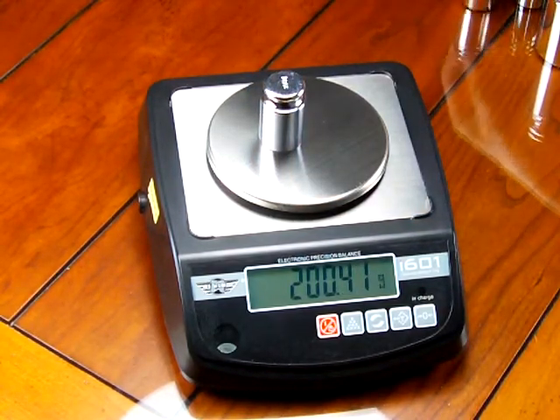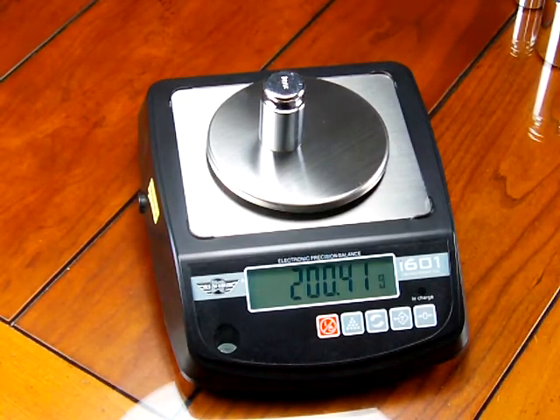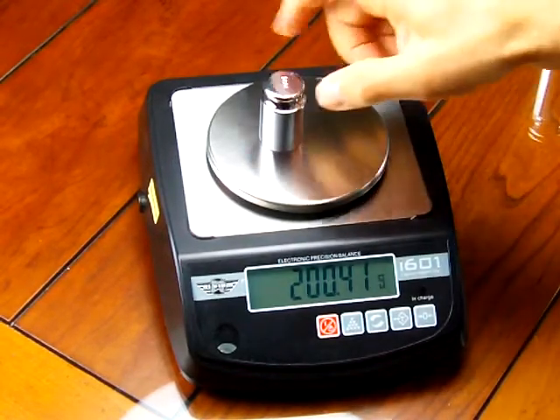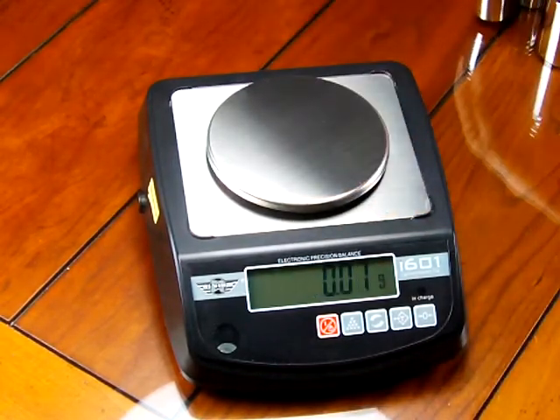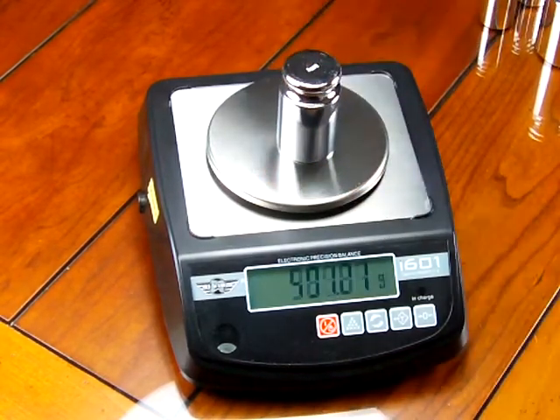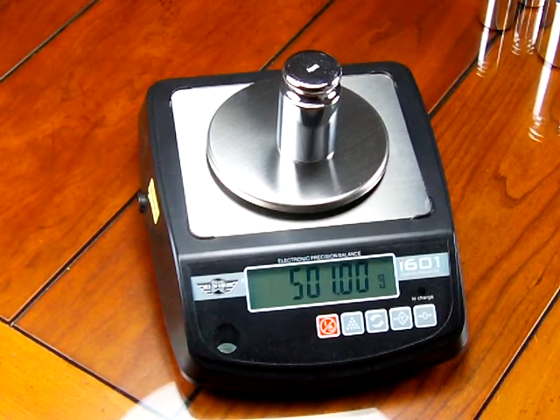I have 200 grams is reading 200.41 and 500 grams I have here reads 501 grams. So you can see the scale is off.